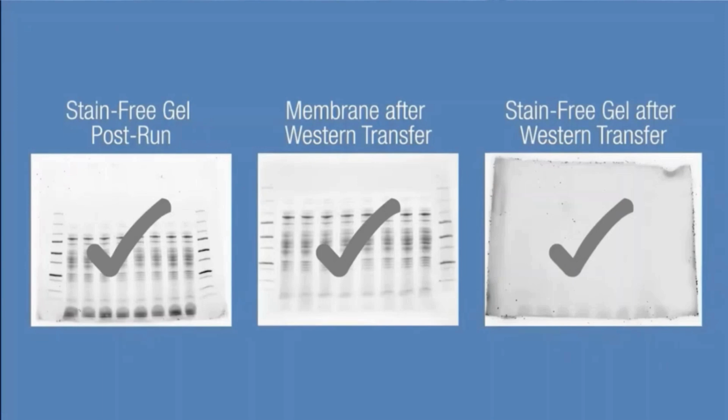And when you stain your gels, if you don't destain properly, let's talk about Coomassie staining, Coomassie also binds to the gel instead of proteins, and you need proper destaining to see the low amount of protein on the gel. So it's not so easy to detect whether your blotting experiment worked perfectly or not.